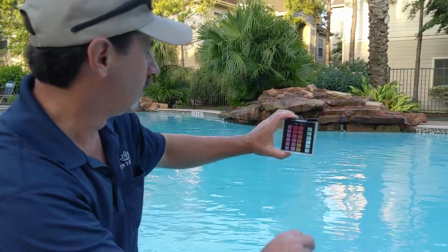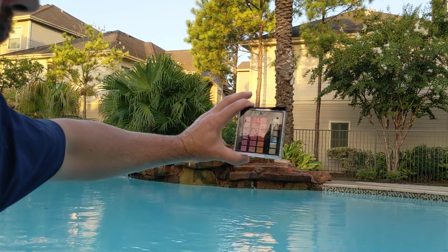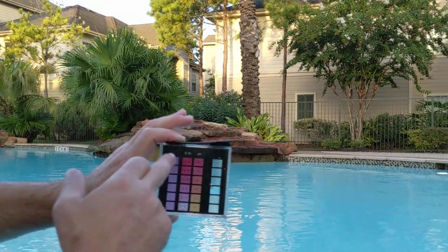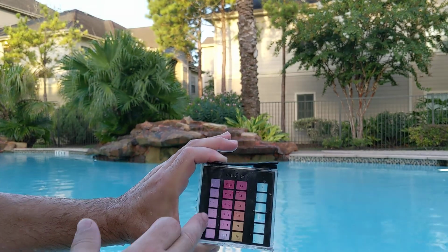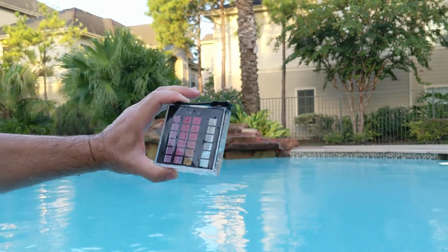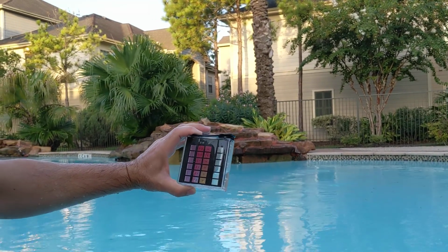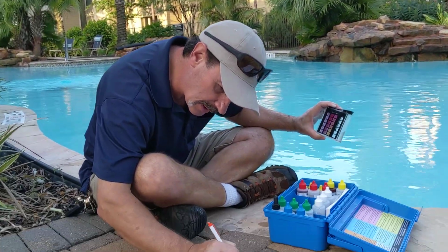So then we're going to compare the color to the side here. That looks like it's about 3 parts. Now you're going to notice it says CL with a bunch of numbers and BR with a bunch of numbers. This is for chlorine, and that's for bromine. We're not using bromine, we're using chlorine, so we're just concerned about this first row. And if we compare the color, it looks like it's really kind of between the 2 and the 3. We're going to go with 3 on that, so we're going to log that.